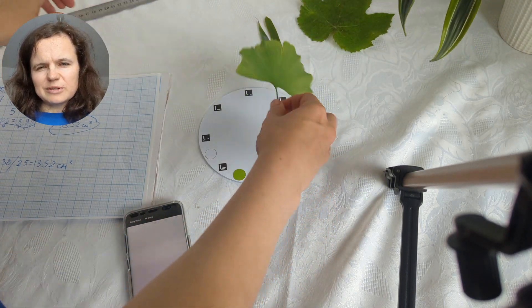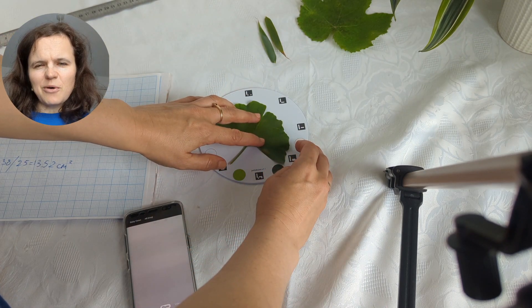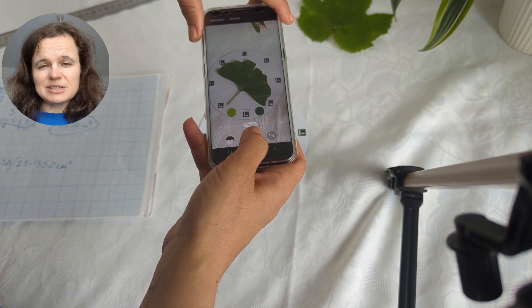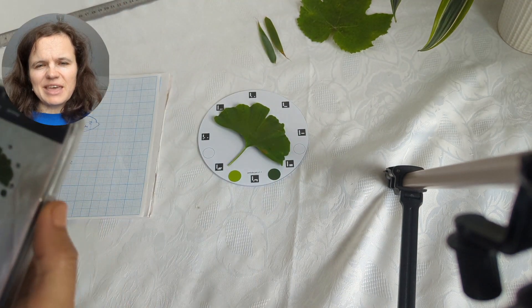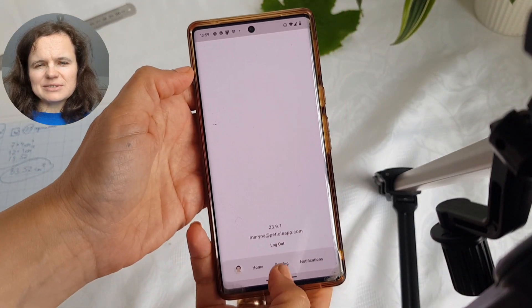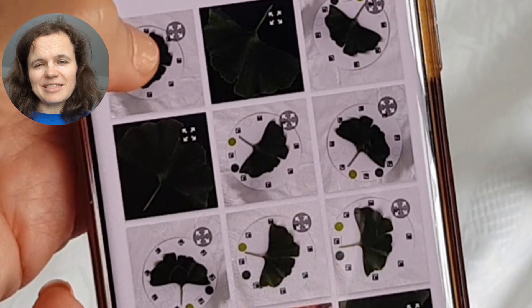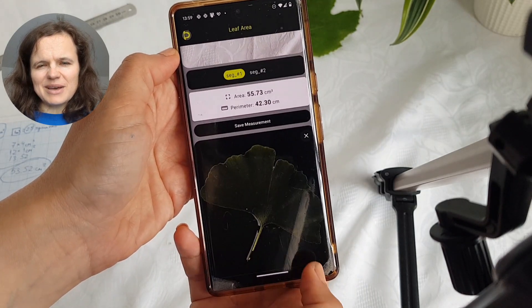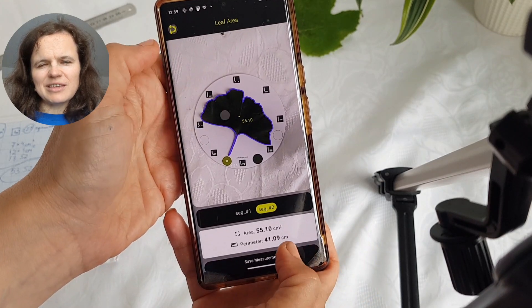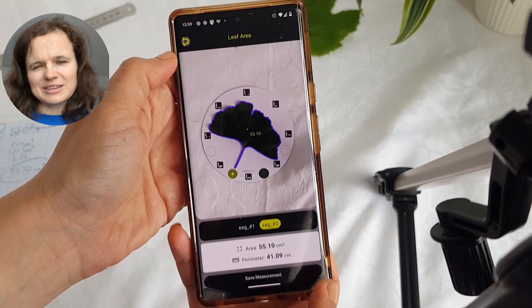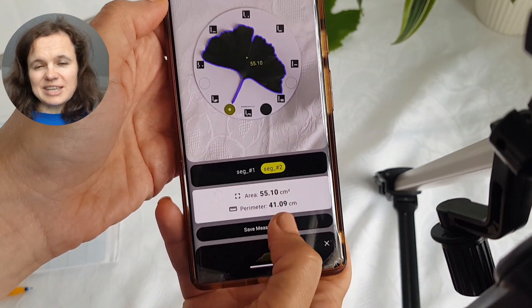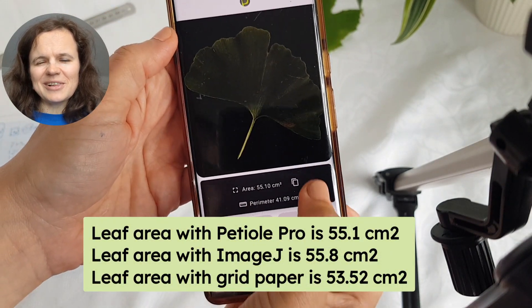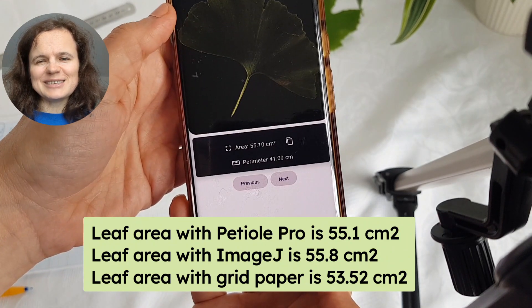To measure leaf area with PTL Pro, first of all you need to capture a photo of your leaf placed on a calibrating plate. Please don't cover any markers visible on the calibrating plate since it impacts the accuracy. Then you upload this photo into the mobile application and you will see the magic — the area of your leaf. You can select the best segmentation for more accuracy. In this case, the result is 55.1 square centimeters. You are also able to save the measurements and go back to them when you need them, share them with colleagues and collaborators, and enjoy the history of your research.